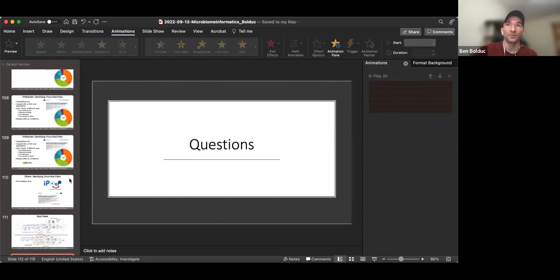In our lab, we often run multiple virus prediction tools because they all have their strengths and weaknesses and areas where they're better or worse. Then we aggregate and combine those to have a reduced set; granted, we have fewer viral genomes, but we have a lot more confidence in them. We'd rather put out a lot of high quality, high confidence genomes to the community than just throw whatever we have out there.